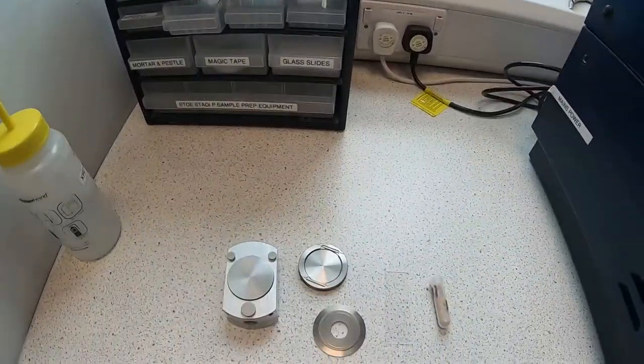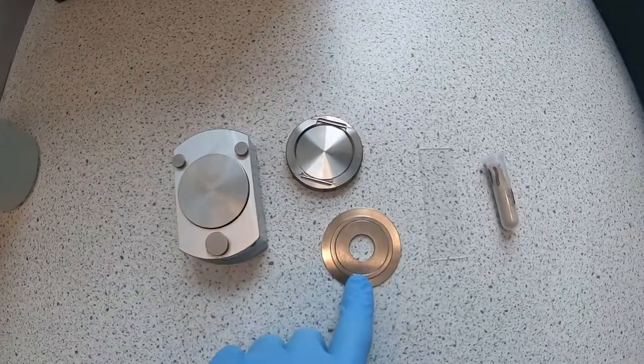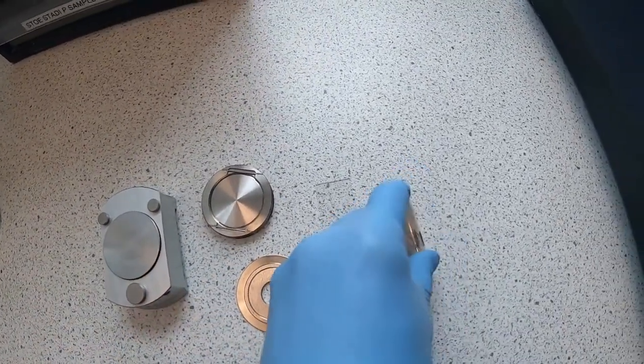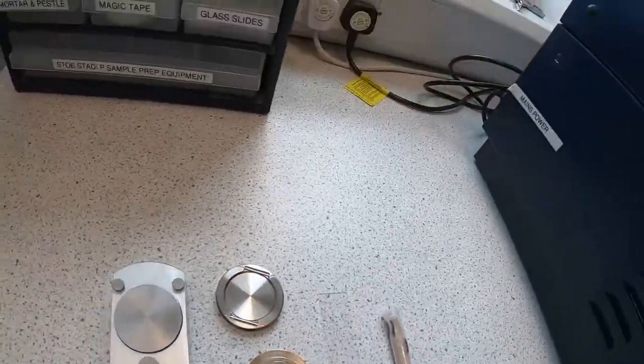Now we're going to quickly move on to how to fill a powder sample. You'll need a few things here: the mount, the sample ring, the sample bank, a glass slide, and our powder. Now I'll put the camera here so you can see what I'm doing.